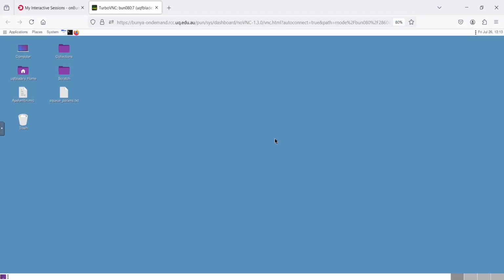Okay, let's get started with RELION. Now, RELION is one of those softwares which takes a little bit of time to get used to, and there's an excellent tutorial for this on Google. So just Google RELION 5 tutorial and it'll pop up. So go and grab that, and that will really help you process your data to its full extent.